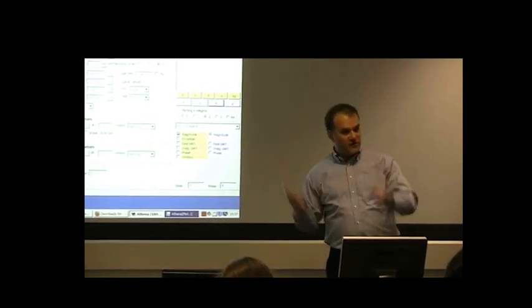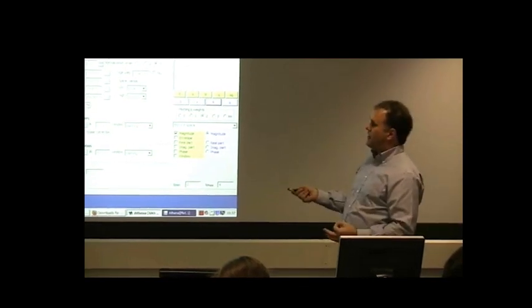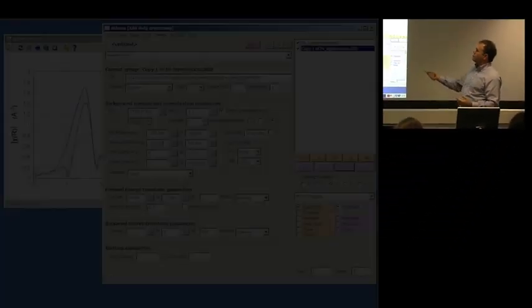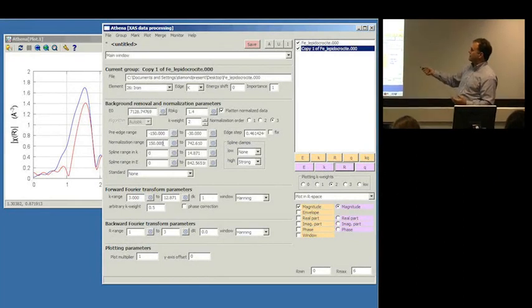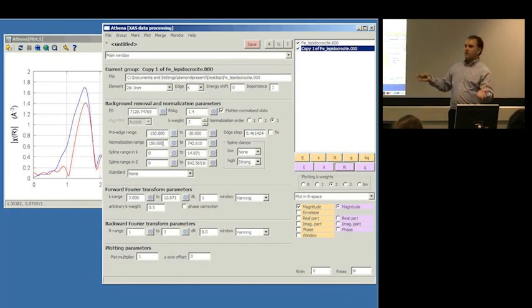The criterion is a statistical criterion, right? Science is about statistics. And the statistical criterion of not changing the answer in the analysis of this peak by virtue of how that number is chosen, that's really the answer. But at the level of Athena, you pick a number that's big enough to do a good job and not so big that you damage the data, and that's the best you can say at the level of Athena.